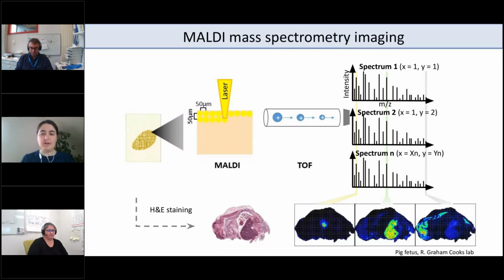Nowadays, sometimes there's ion mobility in between here. And this, of course, helps us to get a certain separation of molecules and to obtain CCS values, which enable or help the annotation of the molecules. And as you can appreciate, typically we are just operating at MS1 level. It's not so easy to do MS2, even though some new studies showed that the field is moving towards MS2 imaging. But so far the standard is MS1, which of course also poses hurdles towards analyte annotation.